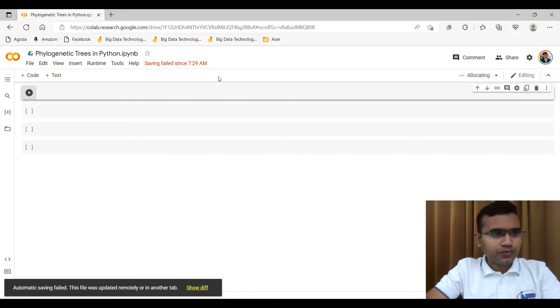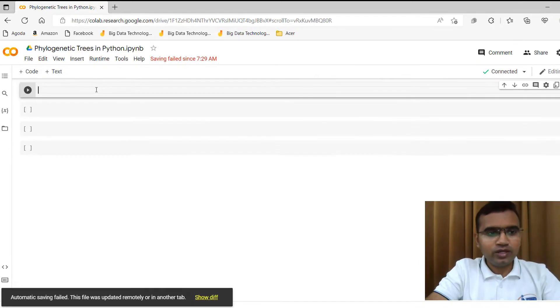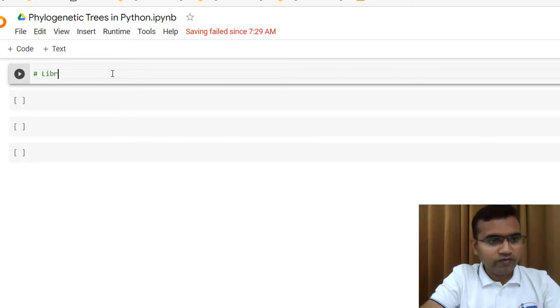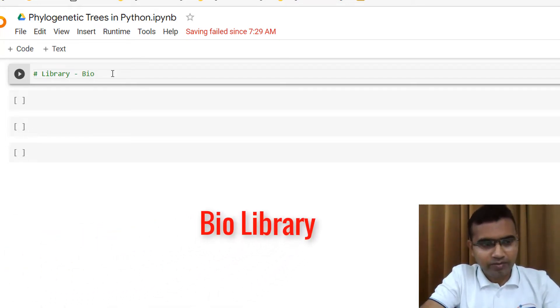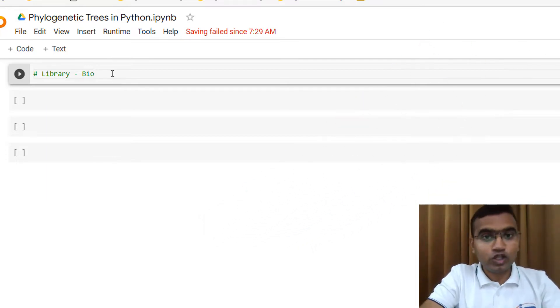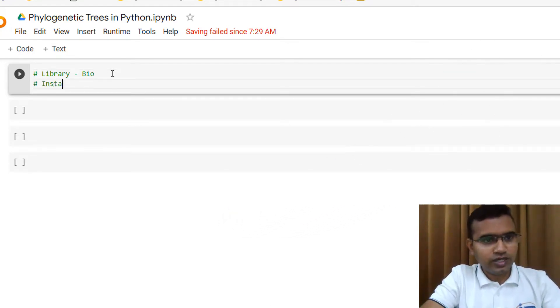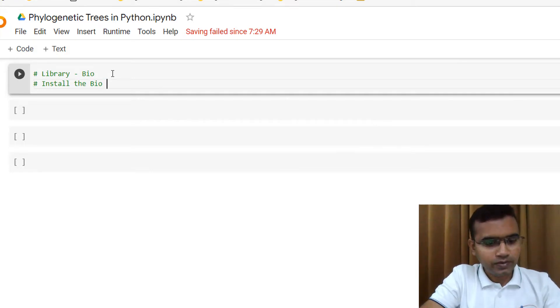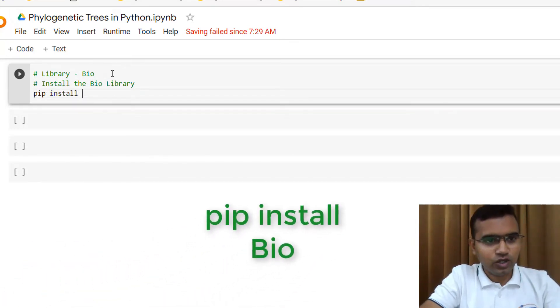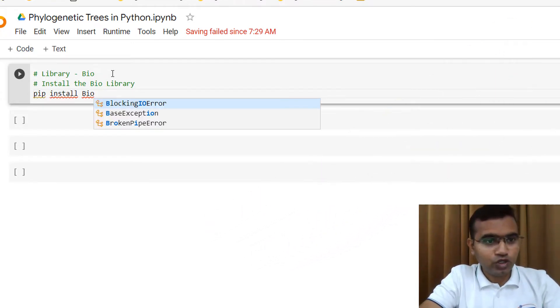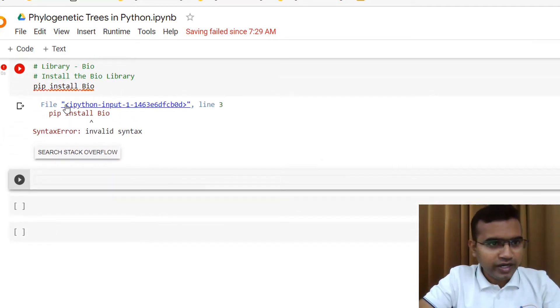Let me connect to my Colab notebook. Because if you want to work with Python, Python gives you a lot of libraries. We will be making use of a library named the Bio library or Python Bio library. If you want to make use of some library you have to install it. You cannot use it without installing it. For that you have to write pip install bio and then execute it.